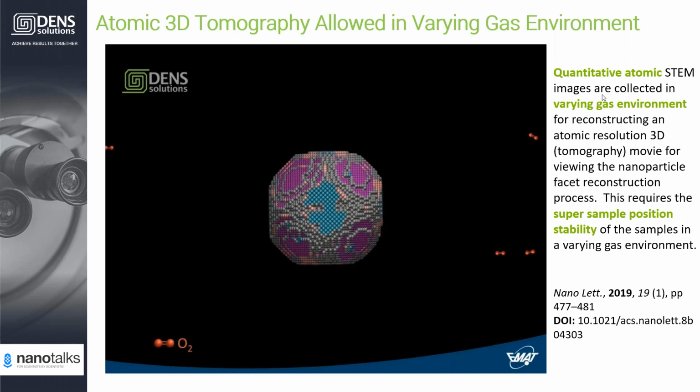Well, in this case, you can do a comparison with an empty nanocell with the gas flowing through, and then compare it with the case where you have the catalyst inside, to see if there are any differences. So I think those are general questions for the TEM society or general questions for confined space research. You can get the answers from some comparisons.